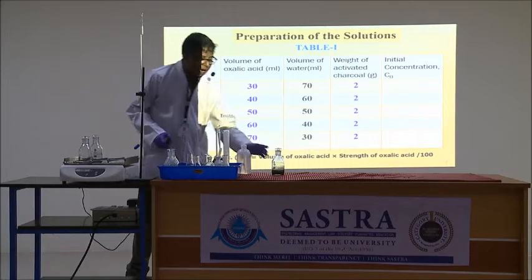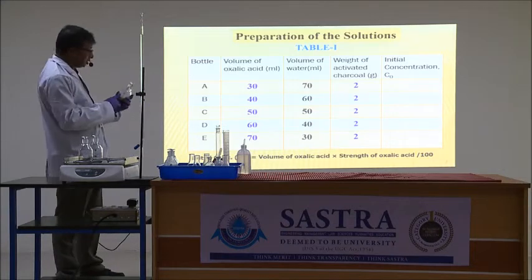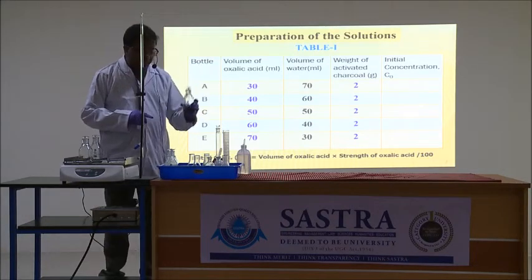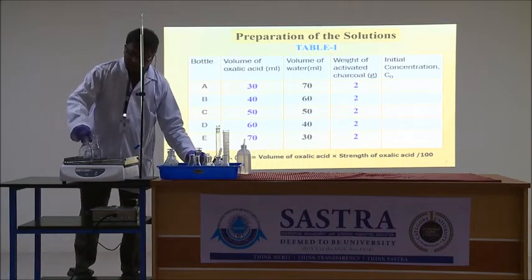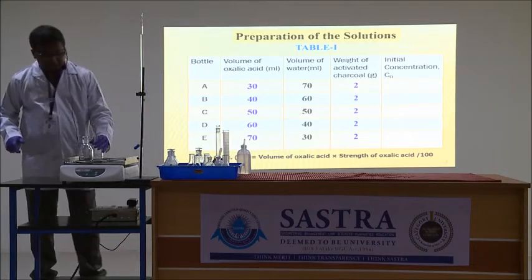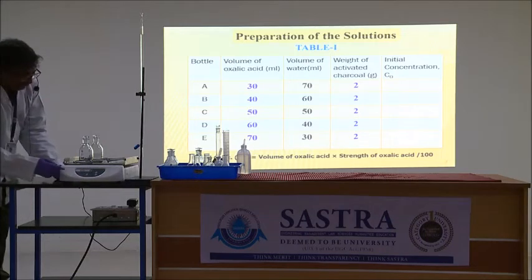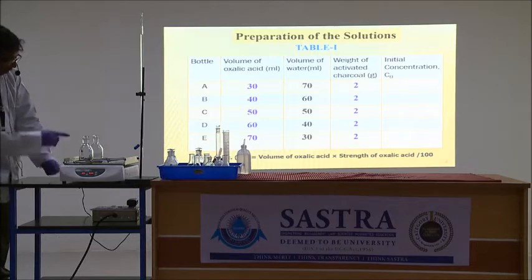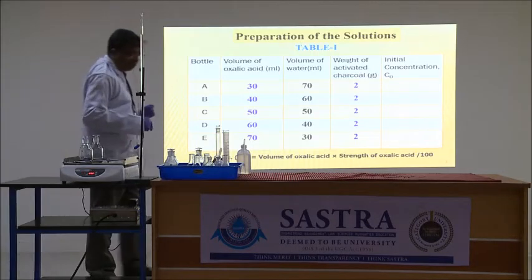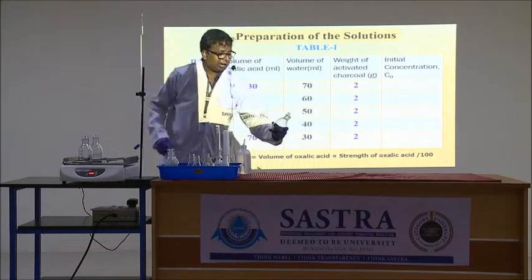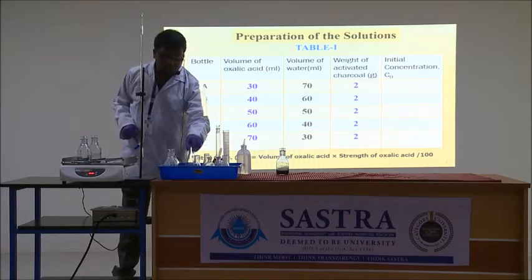We are adding some charcoal to each solution — I have already done that here. After that, we keep the bottles in the mechanical shaker. We check whether they are properly set, set the time, and the shaker will rotate for 30 minutes. After the shaking is complete, we keep the solutions for equilibration, and after that we filter each solution into conical flasks.